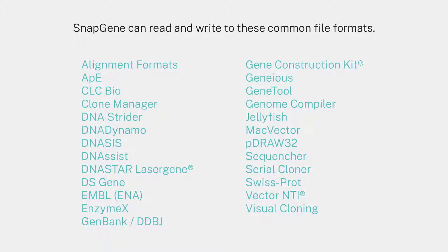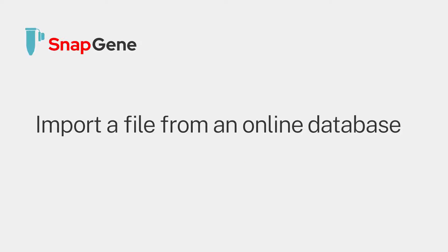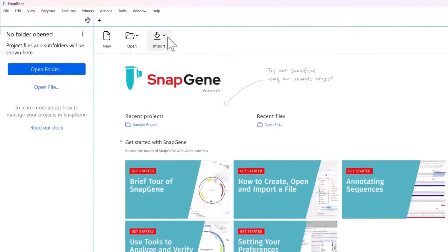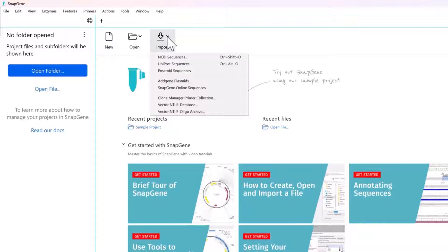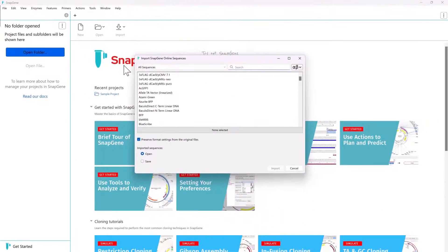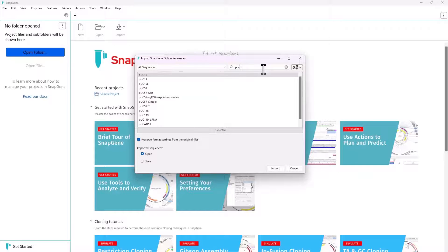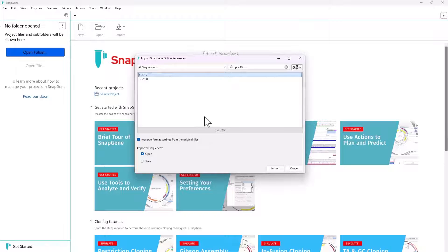You can open many common file types directly in SnapGene. The Import option allows direct access to many online resources. You can select plasmids from the SnapGene online database, choosing from over 2700 annotated sequences, including all common plasmid cloning vectors. Save them for later, or open them directly into SnapGene.